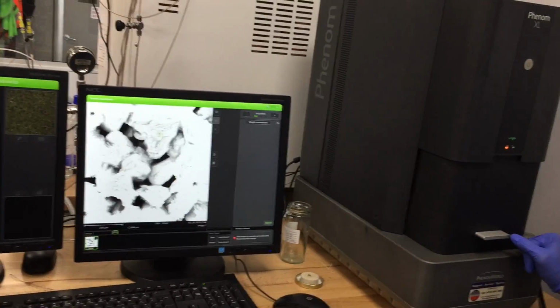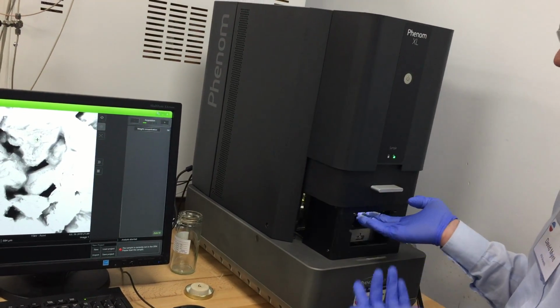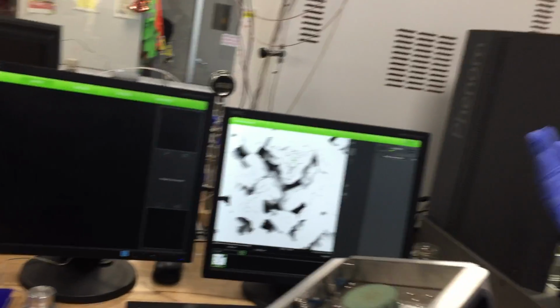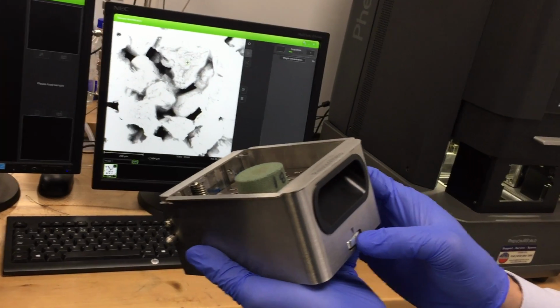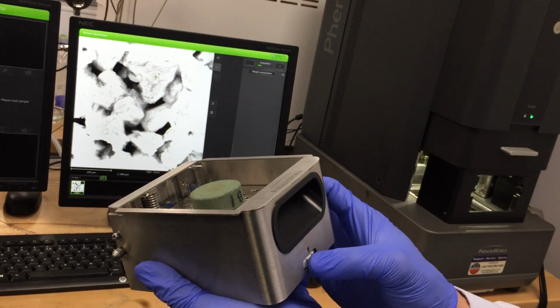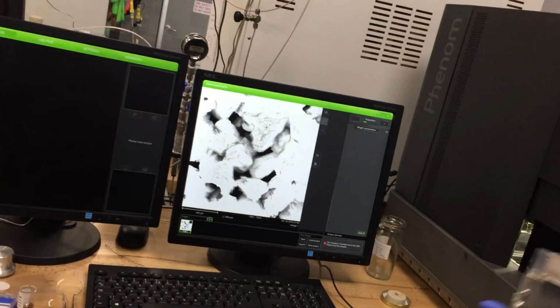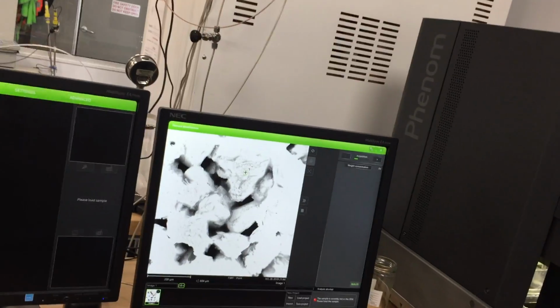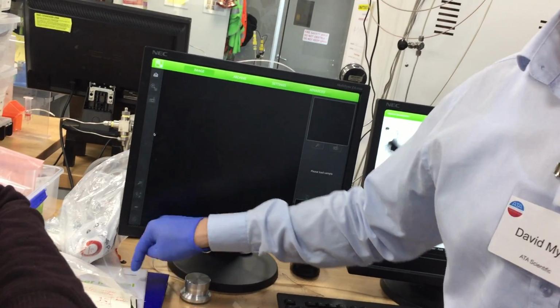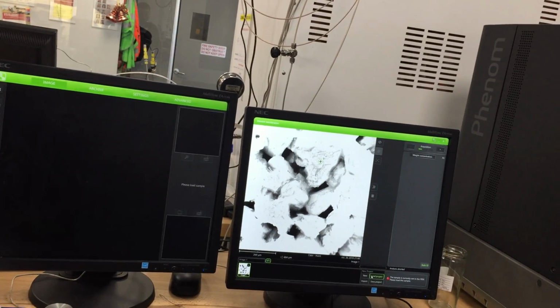We've dialed it down to 4 notches already. So I'm going to dial it down 6 more notches or even 8. So 1, 2, 3, 4, 5, 6, 7. Okay, 8. So you want to lower the level for EDS. Everything is in the manual. It's written there. If you forget, don't worry, just read it.